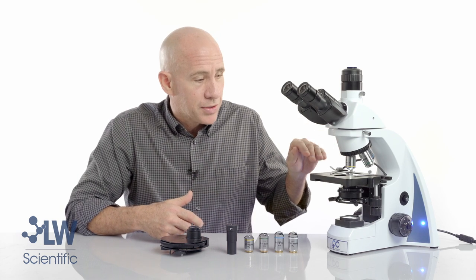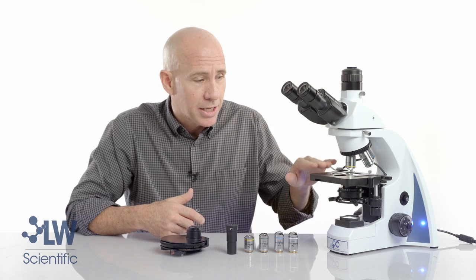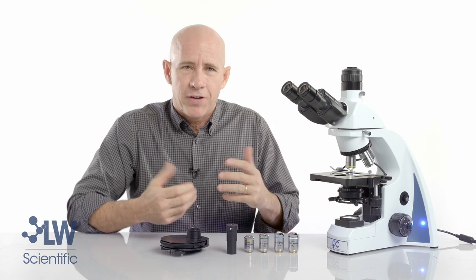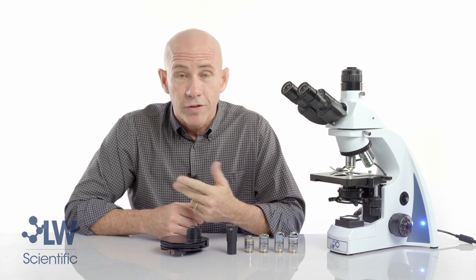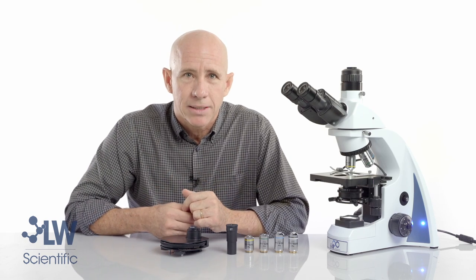The microscope we're using today is the i4 semen evaluation microscope, which has the heated stage on it and will also have phase contrast installed. Phase contrast is a way to view specimens that are unstained, live, moving, or somewhat transparent. It gives you a way of contrasting the specimen without the use of color stain by using indirect light.